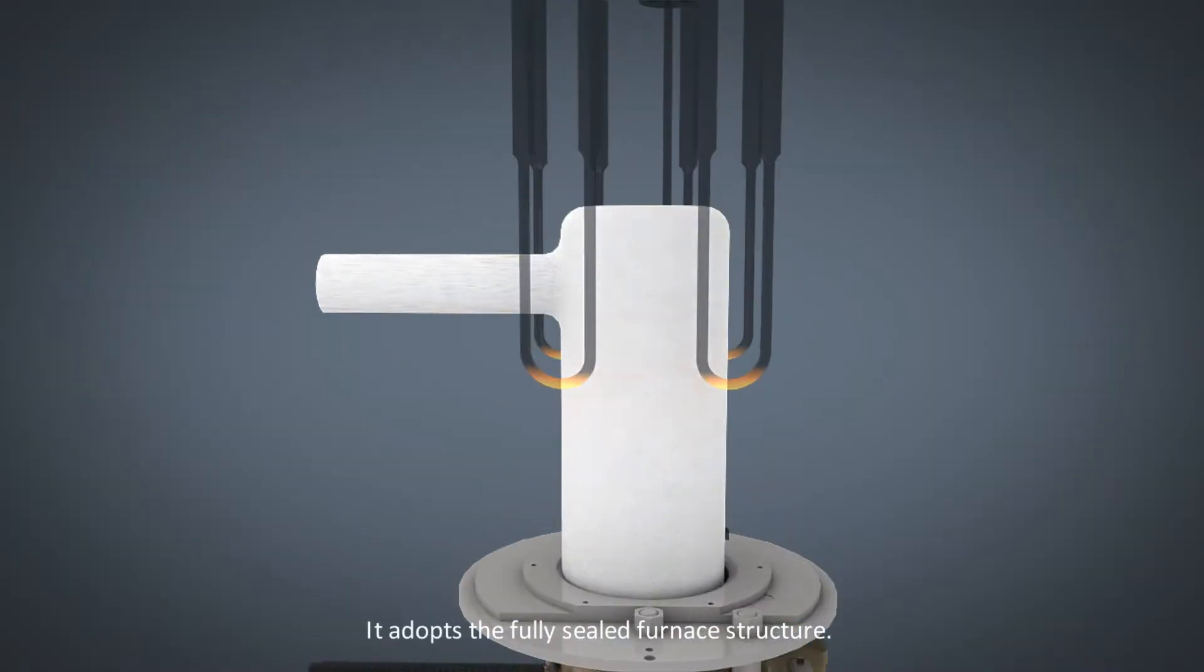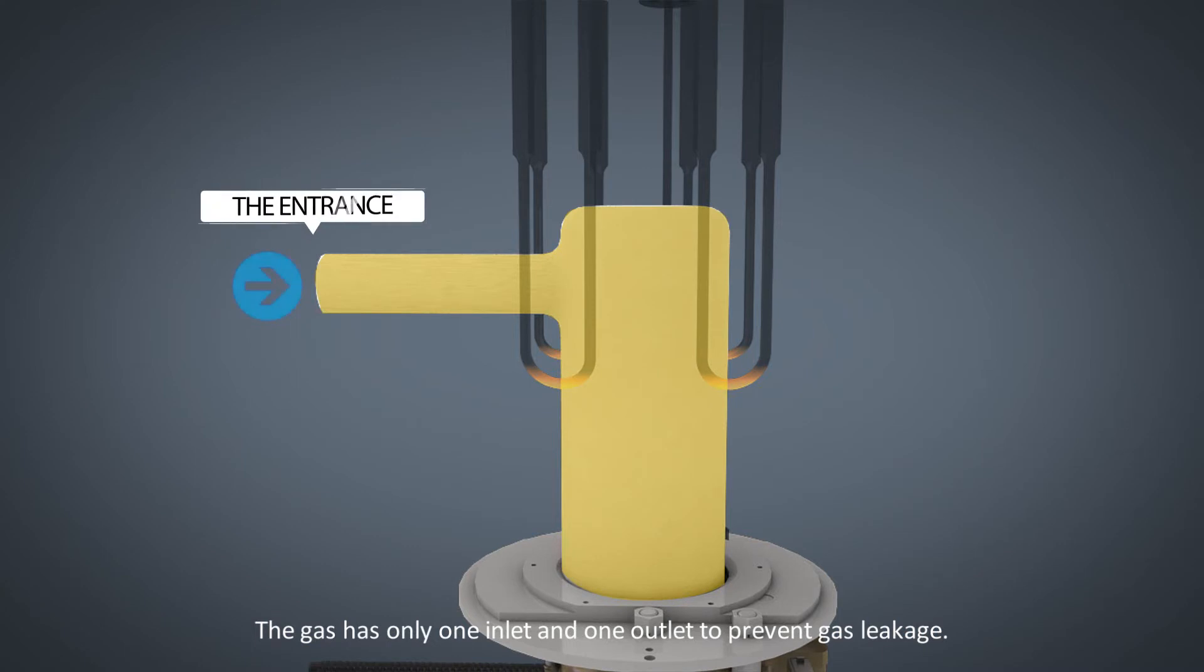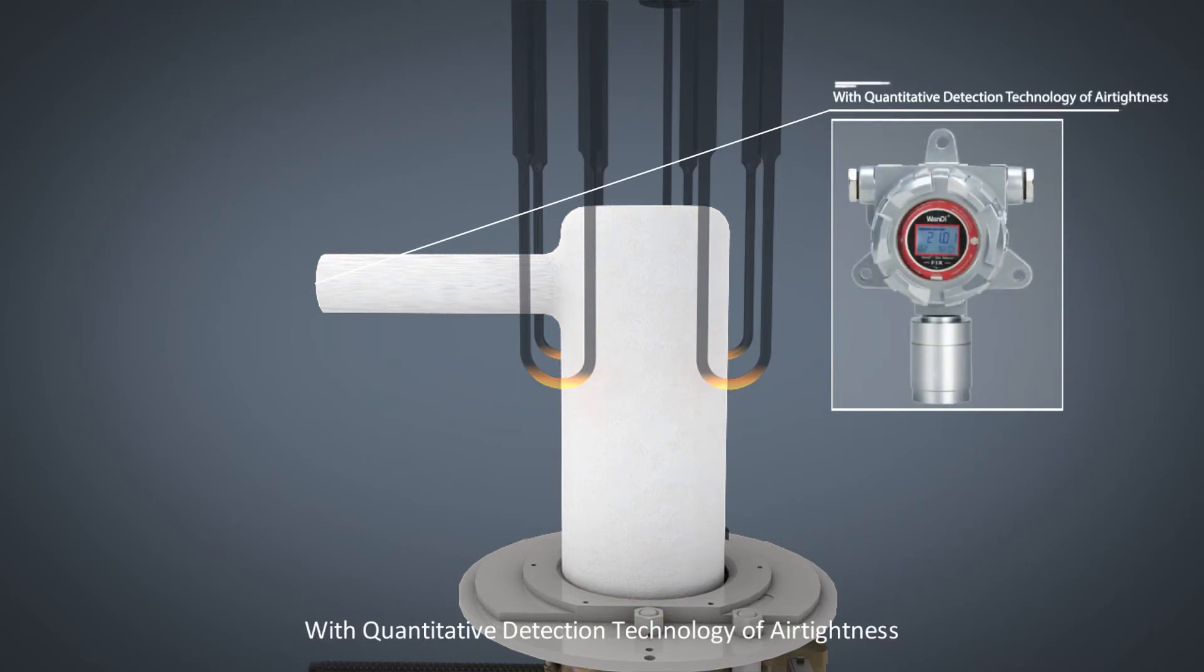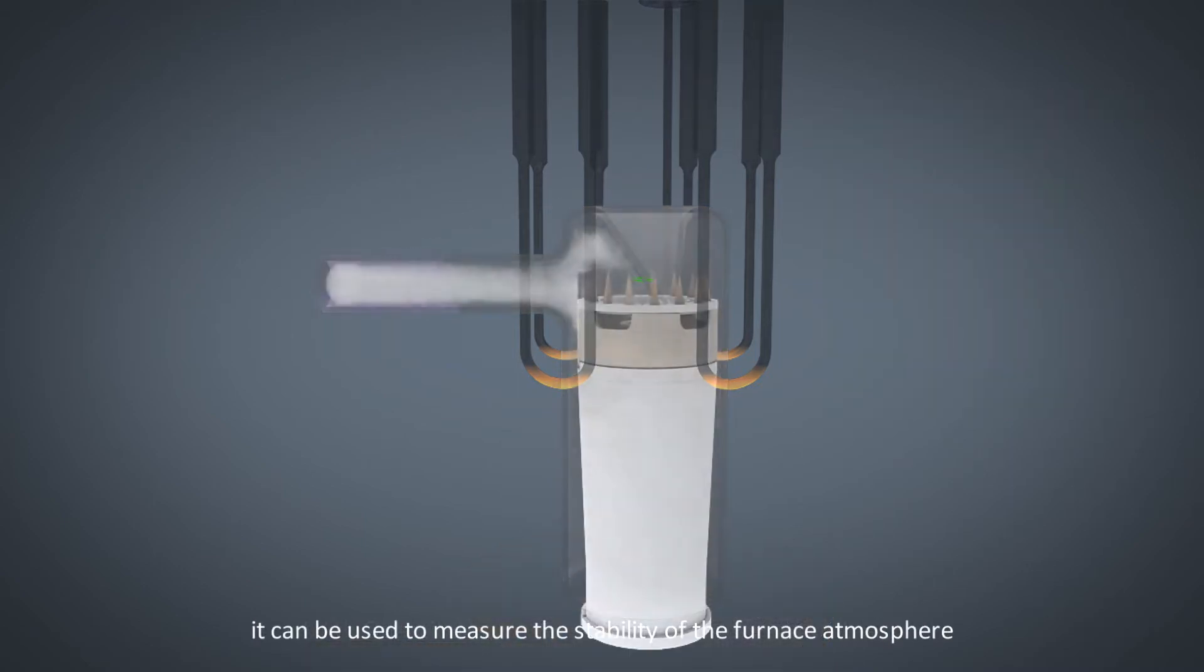First, it adopts a fully sealed furnace structure. The gas has only one inlet and one outlet to prevent gas leakage. With quantitative detection technology of airtightness, it measures the stability of the furnace atmosphere to get accurate analysis results.